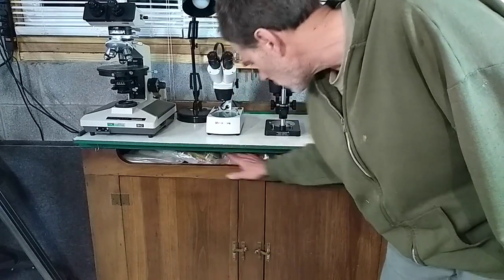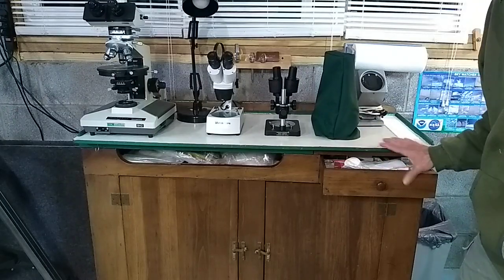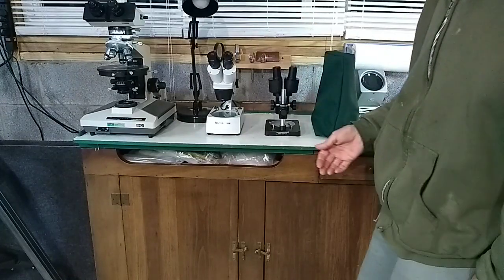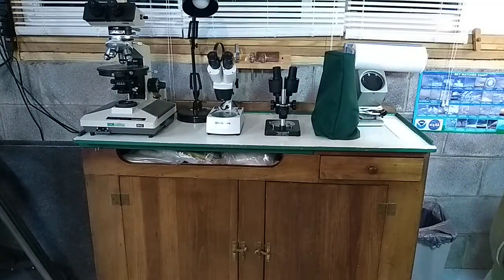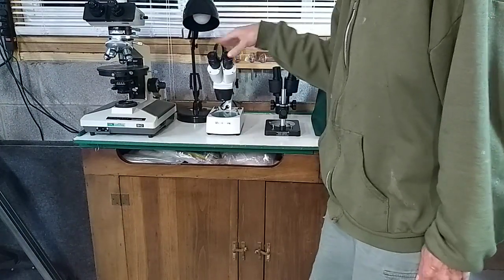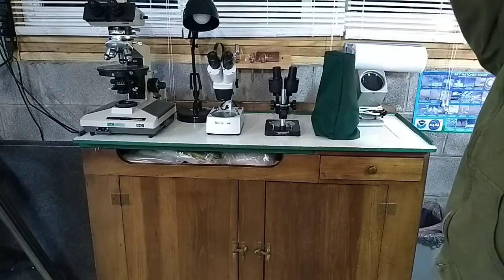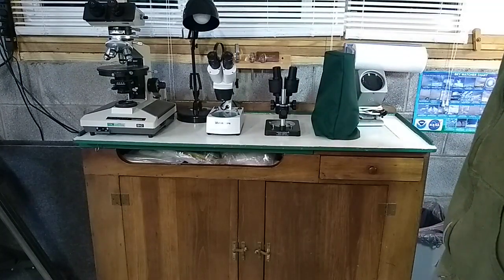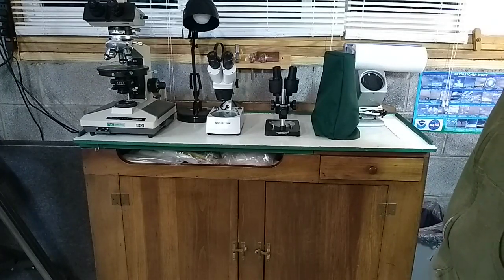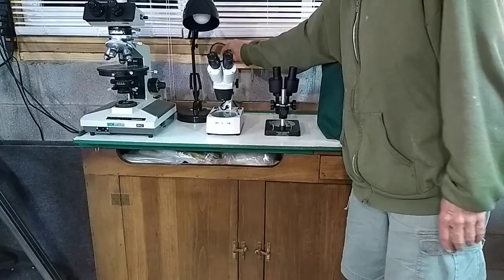I have a lot of bags and things up here. I have things to do with the microscope, since I use this as my microscopy bench, and obviously I keep my microscopes up here. I also have a light. I got that from a garage sale, and a lot of the scopes have built-in lights, but some don't. It's nice because I have it right here by the windows, and I get a lot of natural light in the daytime, so that helps with viewing. I also made a little shelf and holder for a bunch of different magnifiers.